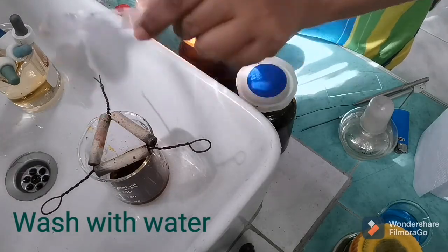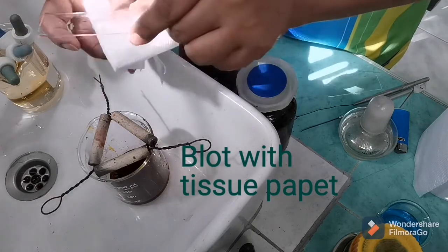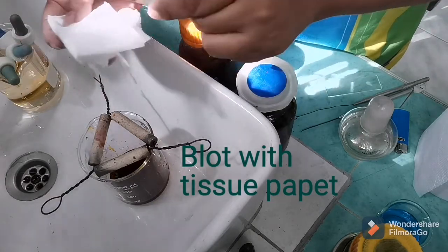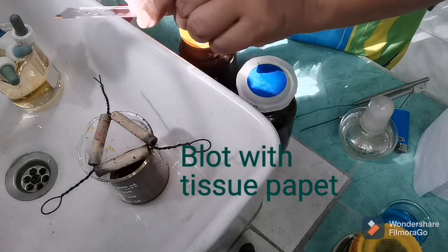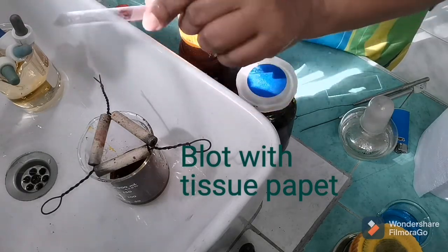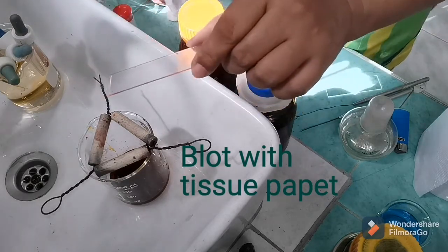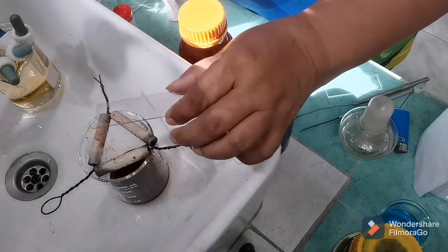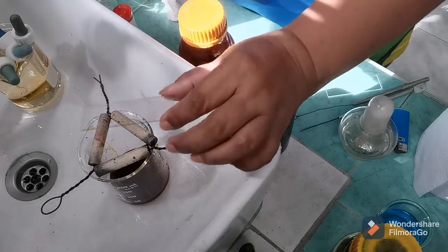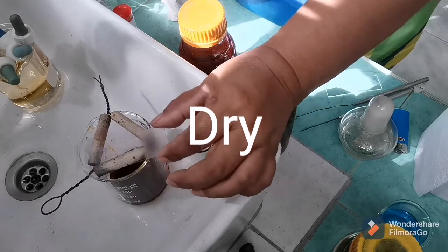So that is how easy staining is. In fact, in other laboratories, they do it in bulk, not just simply one by one. So the individual slides are placed in a container, and then stains are added. So we will just simply wait for this to dry.